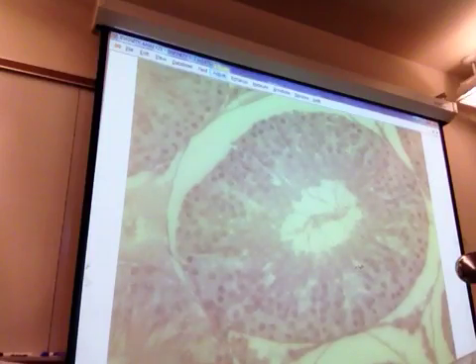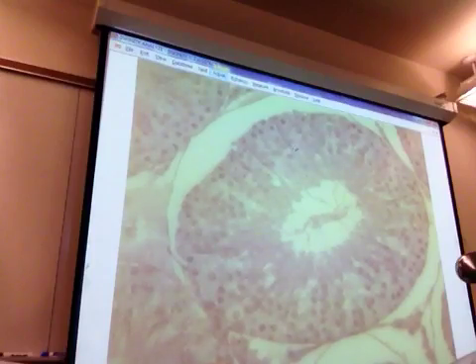So you don't always get a cut this good, but notice how you can see long cells that have a lot of cytoplasm, and then you get stacks in between them. So sometimes a nucleus of one of these is down here and goes all the way up. Sometimes it's not this clean of a cut, so here's another nucleus up here. It goes all the way up, and you can see the cytoplasm going in between all of the spermatocytes. Okay. Do those spermatocytes themselves not have their own cytoplasm?